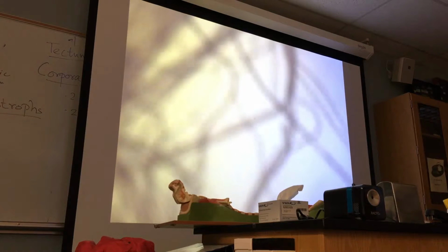Let me magnify this. Here you go. You can see some. Can you see the gap? That is the node of Ranvier. A what? Ranvier, R-A-N-V-I-E-R. It's a French name. Node of Ranvier, or neurofibril node.